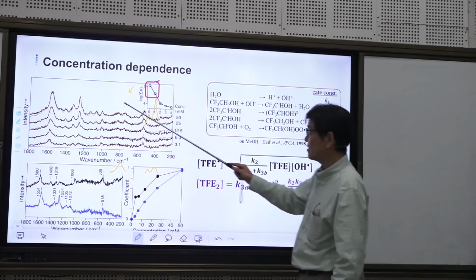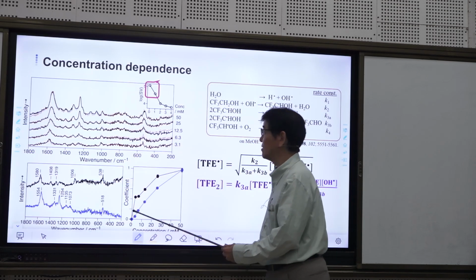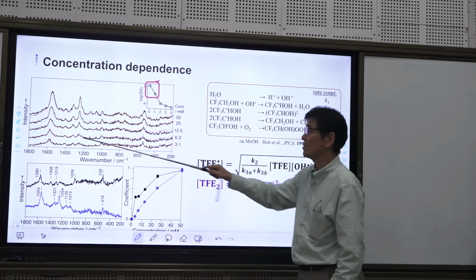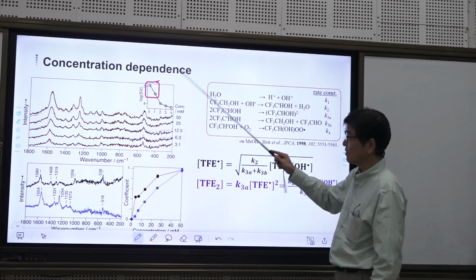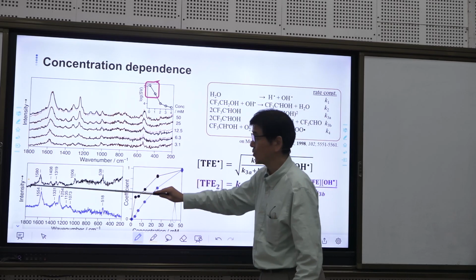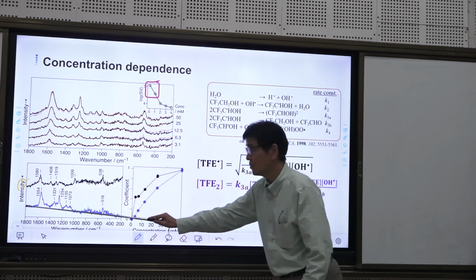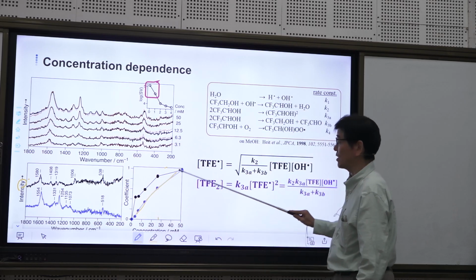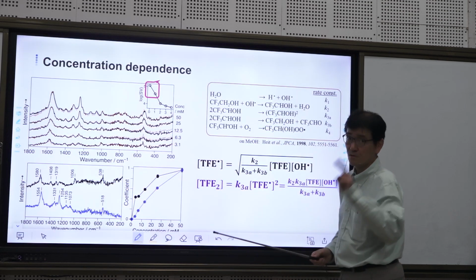So by analyzing the data set using some mathematical way, we found this result contained 2 independent components. And it was shown to be these 2 components: the black spectrum with black concentration dependence, and the blue spectrum with blue concentration dependence. There are 2 components.